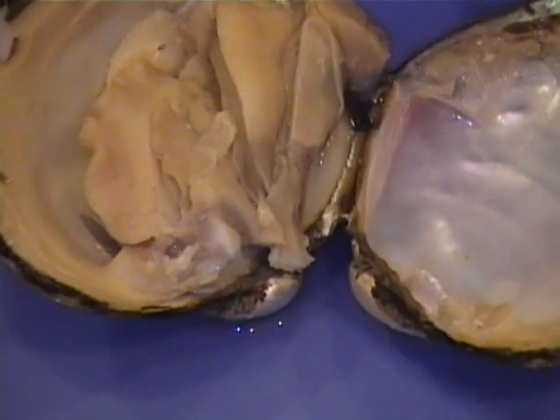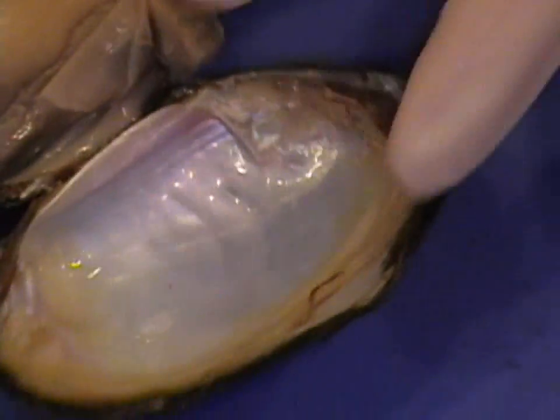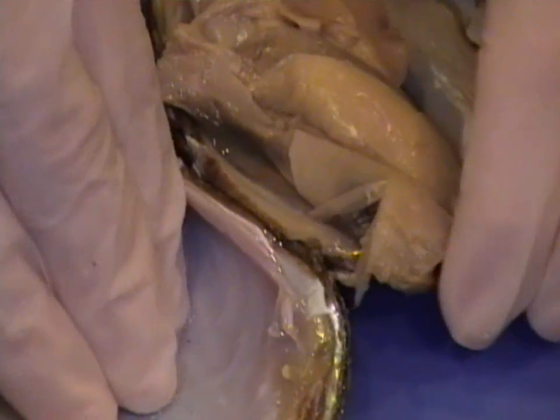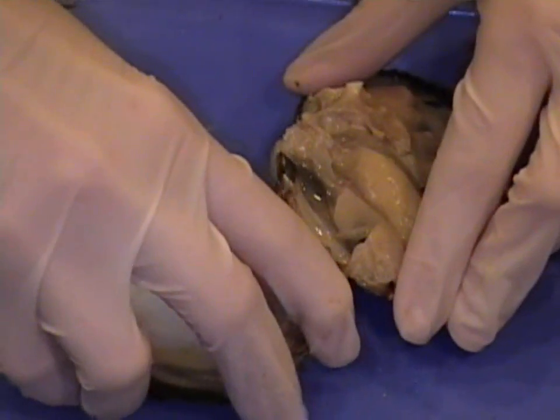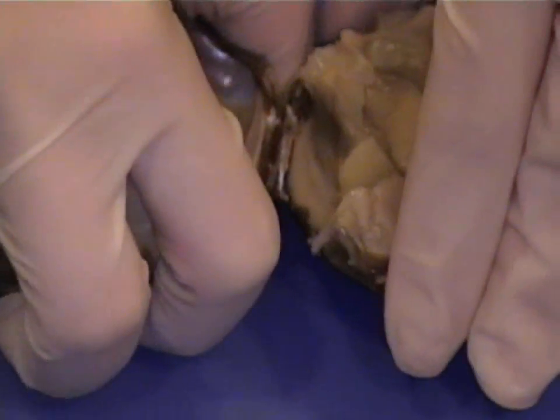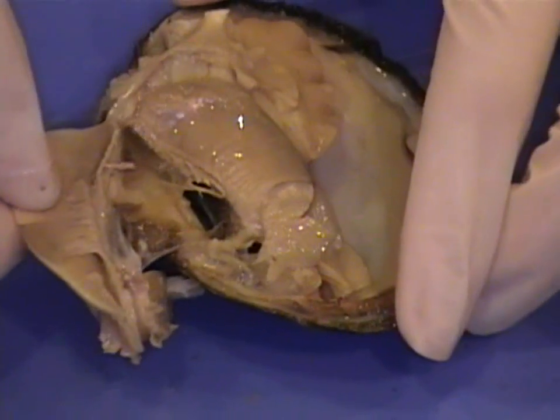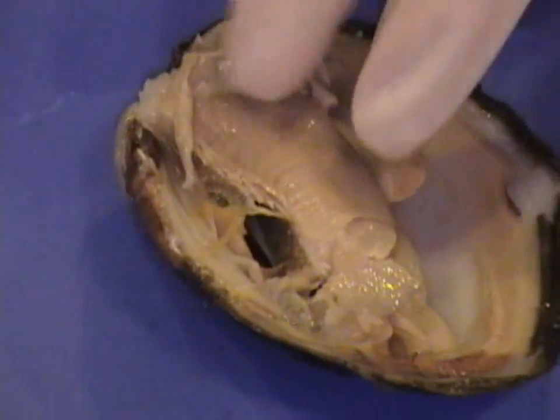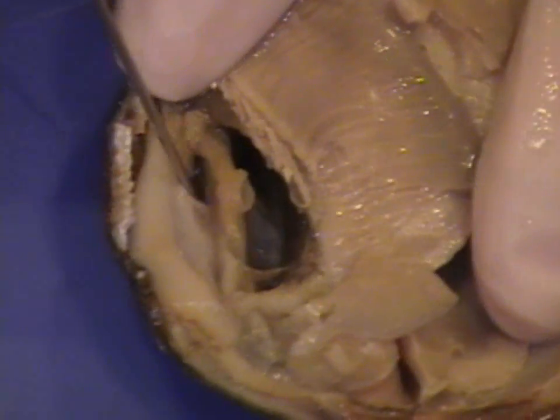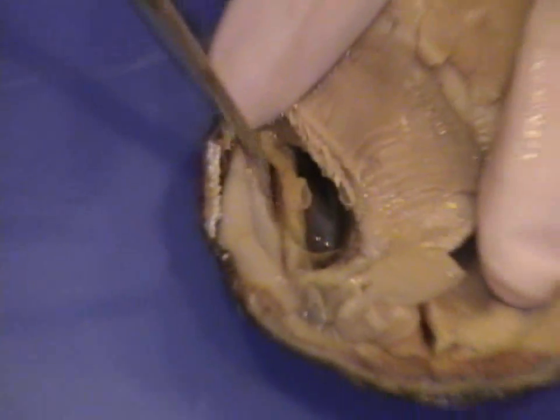The next structure we're going to take a look at is the heart, which lies dorsally. We're going to break off this other valve, breaking through the internal hinge ligament — it's kind of tough. See the hinge ligaments right there. In order to find the heart, we're going to remove one of the gills — the outside gill. And under this thin little layer right here, you're going to find the heart. The heart is right there.